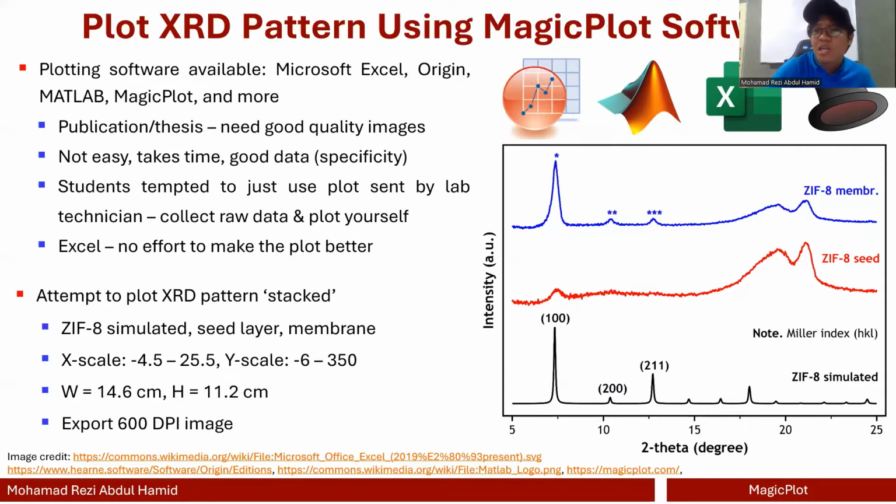Now, the issue that I observe when I see student theses or even review manuscripts is that some people just use whatever plot they got from the operator. Sometimes it's okay, I guess, but it'd be even better if you can create it yourself, because normally the one that you get from the operator probably has a low resolution, and sometimes you need to stack the plots to have a better comparison, and so on and so forth.